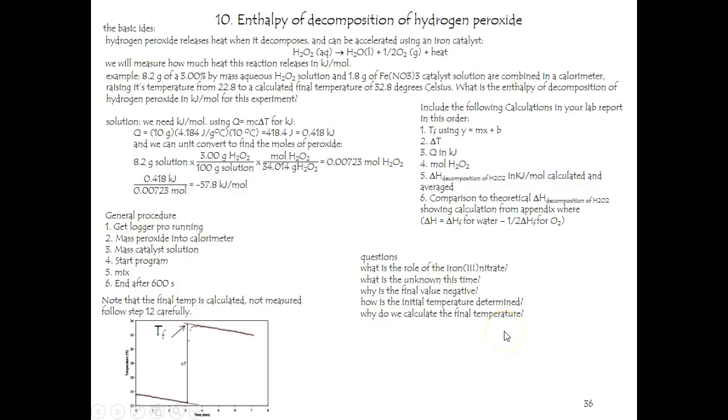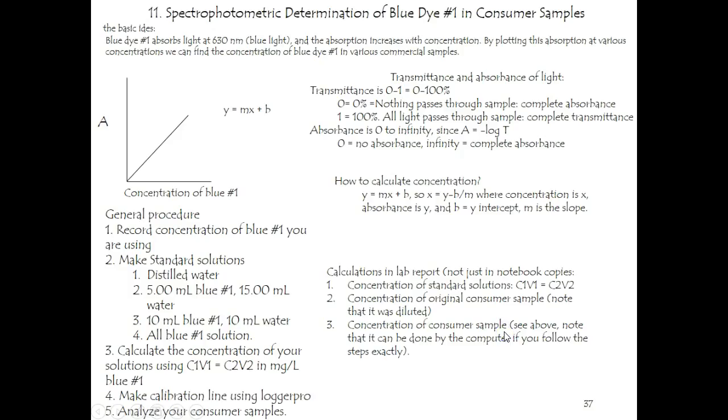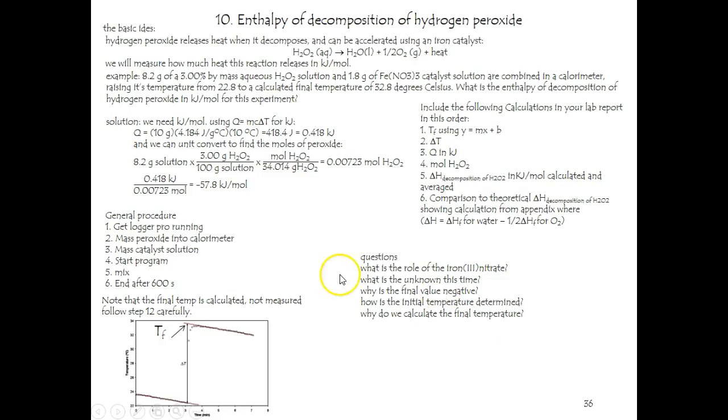Why do we calculate the final temperature rather than just measure it? And this is the enthalpy of the decomposition of hydrogen peroxide.